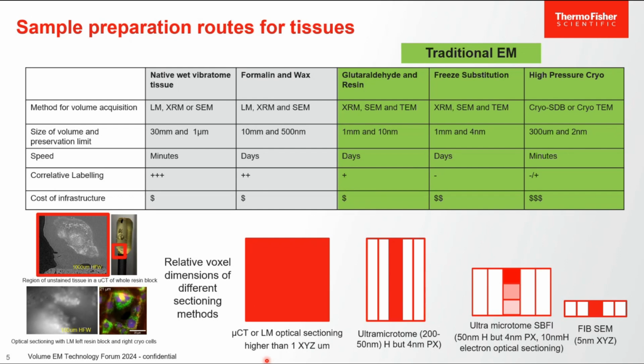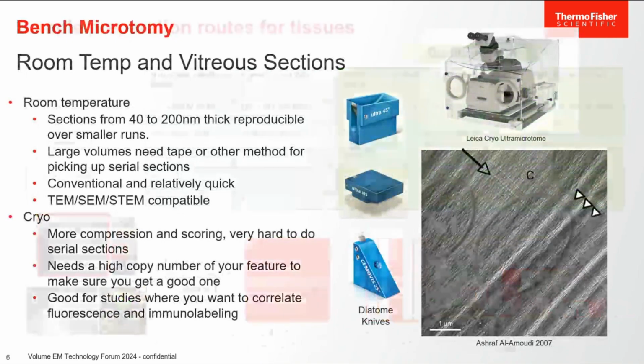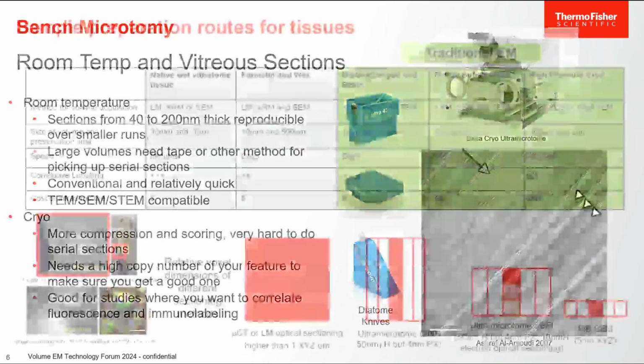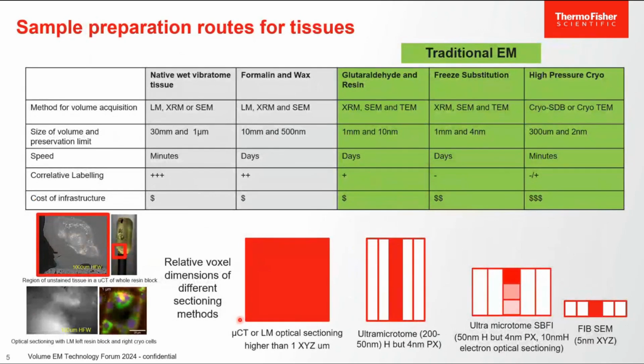I think for me, there are several ways to section for these. Down at the bottom, sorry, I'll get back a bit, you can see two optical movies running, hopefully. PowerPoint's doing something funny. They're really showing that you can do optical sectioning.